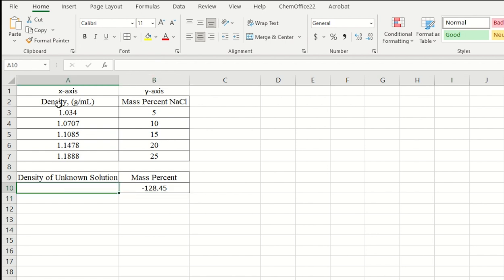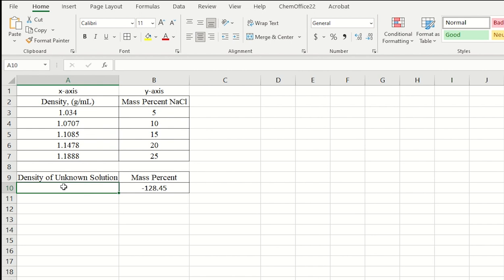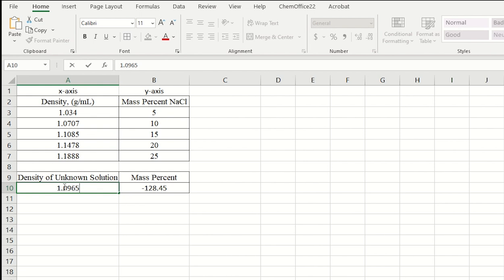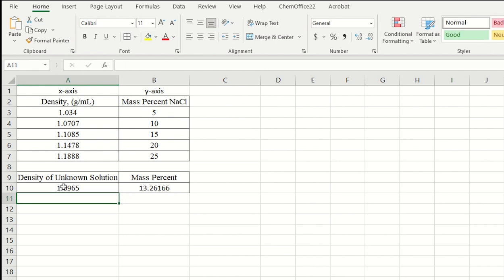And so for your unknown solution, you will measure a density. Now again, you don't know the mass percent. So when you measure a density in lab, you'll go ahead and plug that in. And again, for sample data, let's just say that I measure a density of 1.0965. And so in your experimental data, you measured this density. Notice how I plug it in, and it does the calculation for me.